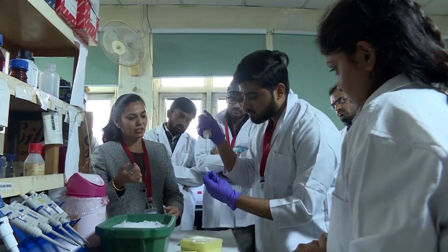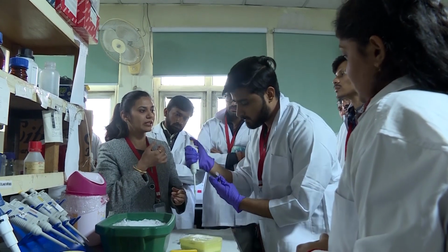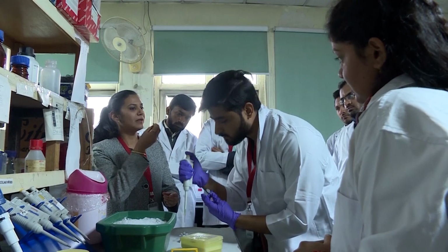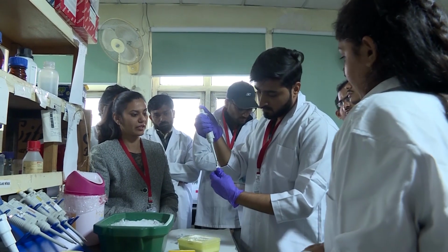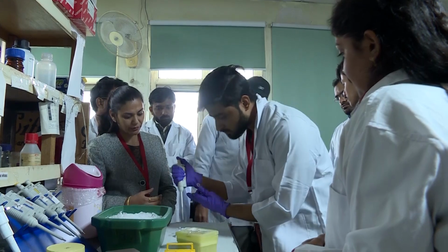Try to keep it at the bottom, and don't pipette it so many times. Then it will create bubbles, and sometimes it may get stuck in the tip, so loss will happen. Okay, we have to be very careful. Try to keep it at the bottom.